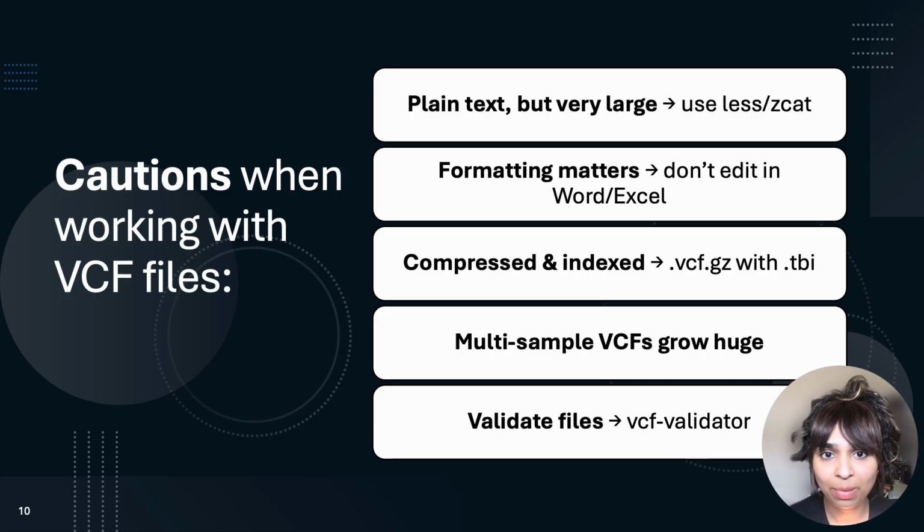Now before we wrap up, let's talk about a few cautions when working with VCF files. Now VCFs are plain text files. Yes, you can open them with Word, Notepad or any text editor, but that's not always a good idea, especially for such big files, because they can be gigabytes in size and may crash your editor. Instead, always use command line tools to open your VCF files.